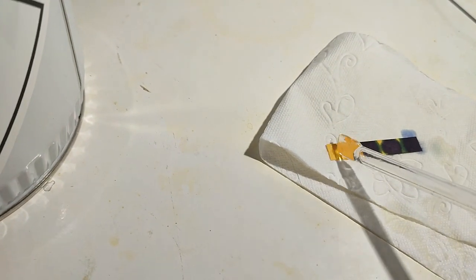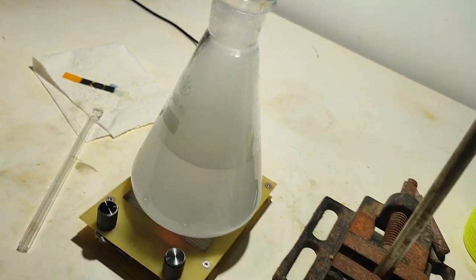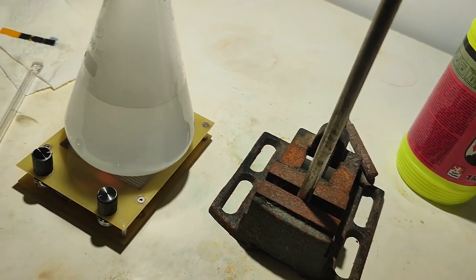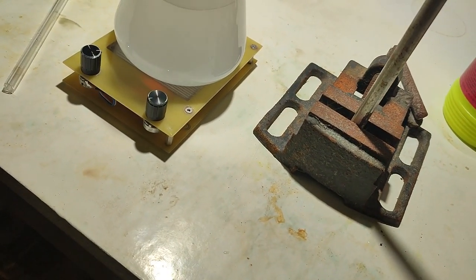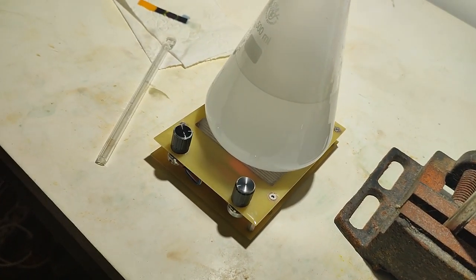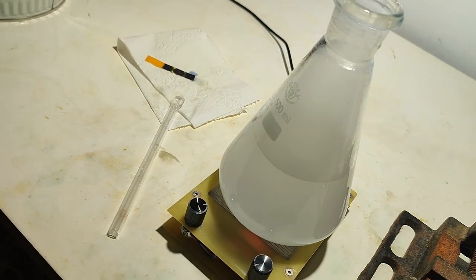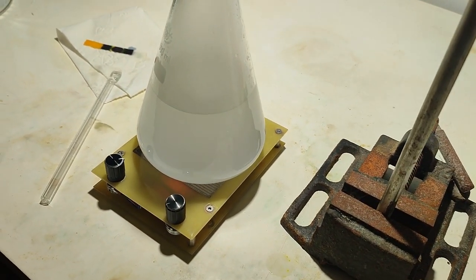Well, there's not much space here, but... oh, it can get more. Yeah, and I already can smell it. Fucking heating. I can smell it. They say it has acrid odor. I'm not sure what acrid means, but this smells like acetic acid. Like nearly exactly like acetic acid.